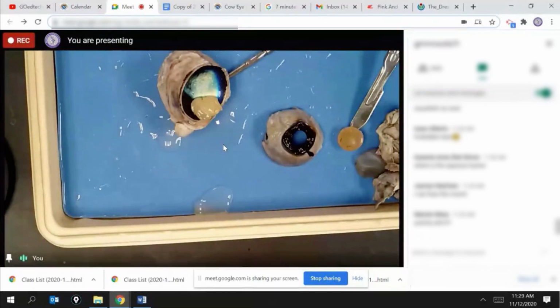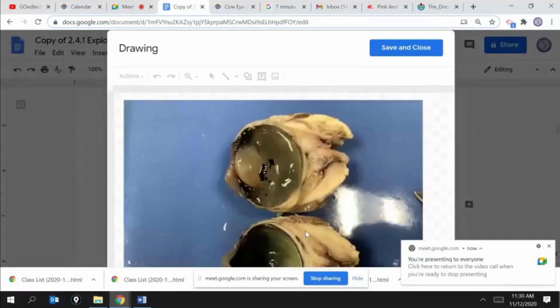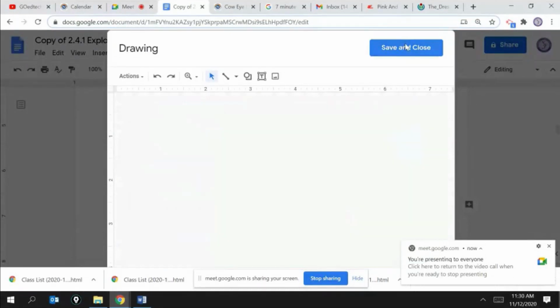So you can label that. This is a little bit more difficult to label on your document. I didn't really have a good place to put that. However, I would say right in here, we can see it attaches. I would put my blind spot somewhere right in here, down on the bottom. Okay.